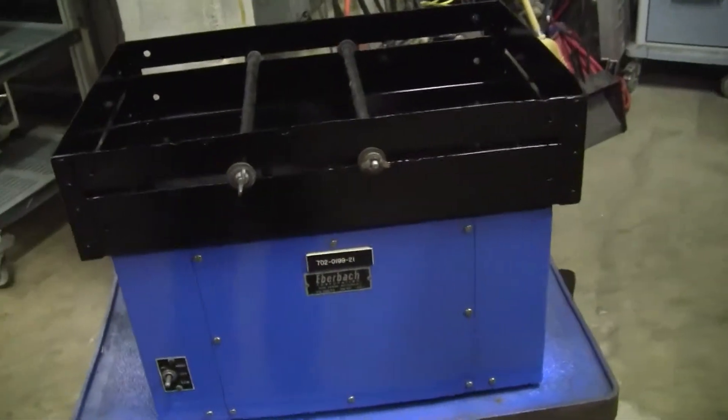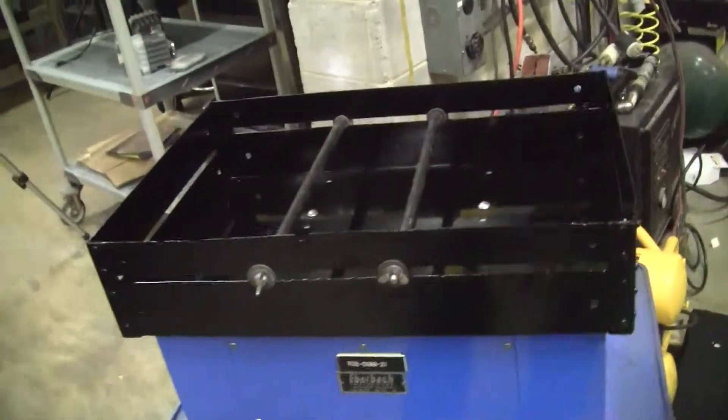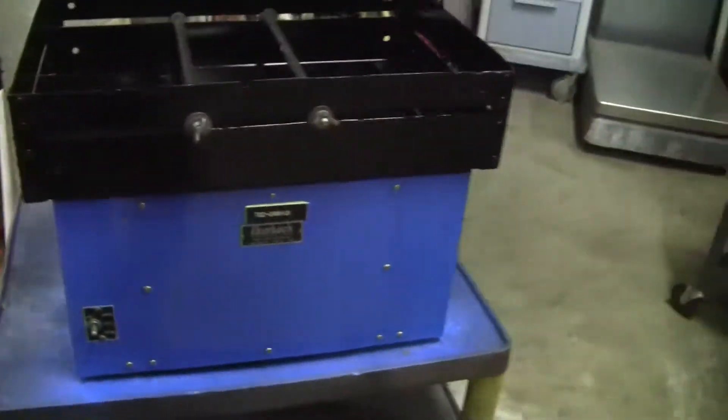Hi, this is Michael Natow from Hi-Tech Trader. Today we're looking at the Eberbach Shaker. Two posts for holding your vials.